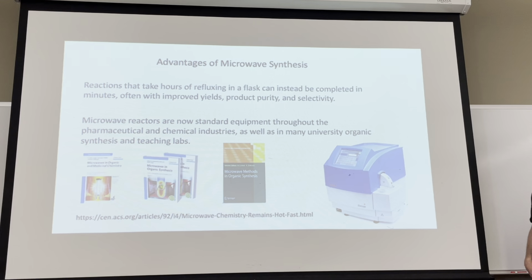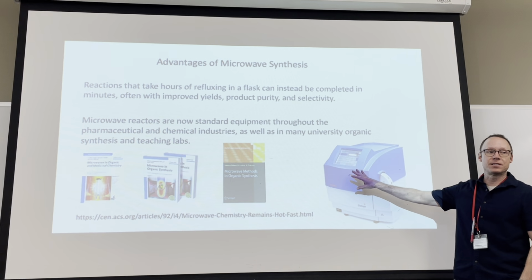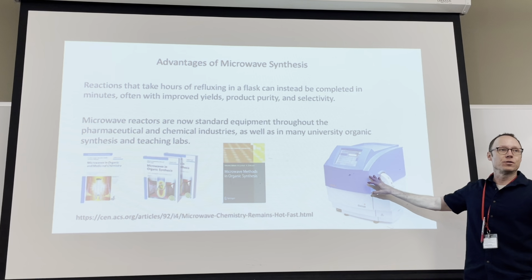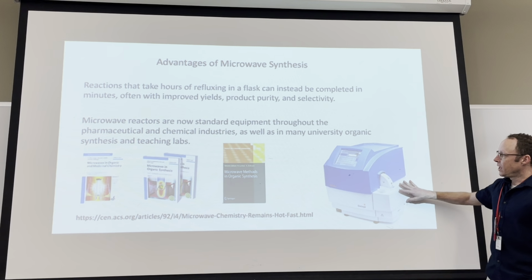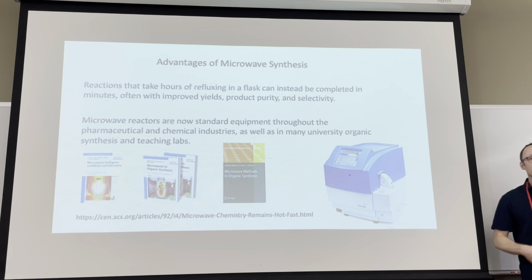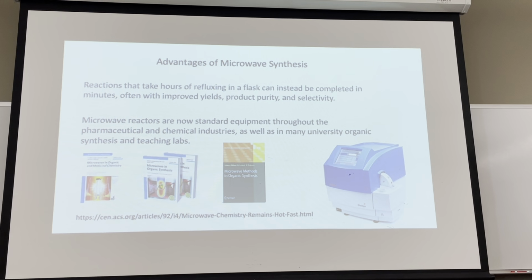But what you can see is that these are truly lab instruments. This doesn't look like the microwave in the 7-Eleven where you microwave your burrito, right? It is actual lab equipment. You know, they have all sorts of different variables you can change, and they are not exactly inexpensive.